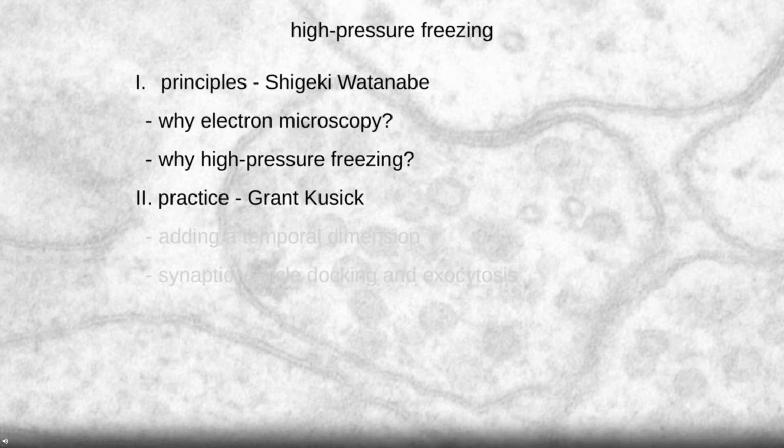Thanks very much, Shigeki. So yeah, I'm Grant, a Ph.D. candidate in Shigeki's lab, and I'm going to talk about how we can combine the nanometer resolution of electron microscopy with the millisecond precision of high pressure freezing to look at membrane dynamics at synapses.